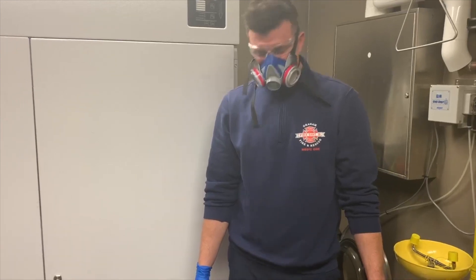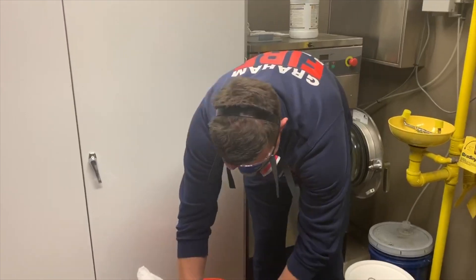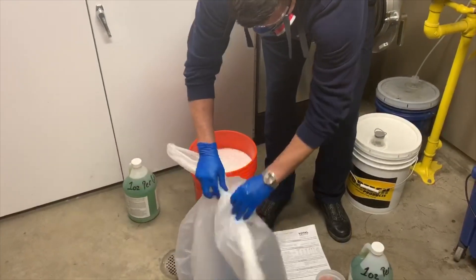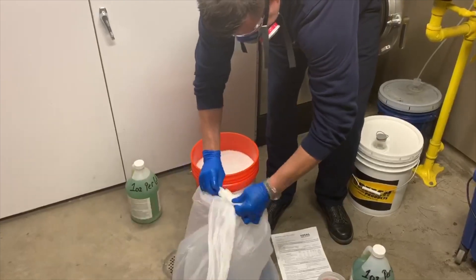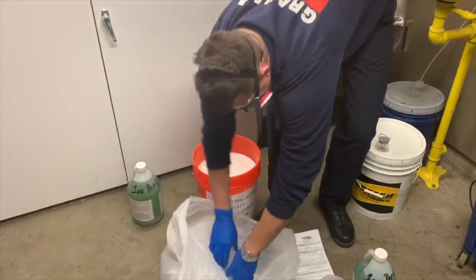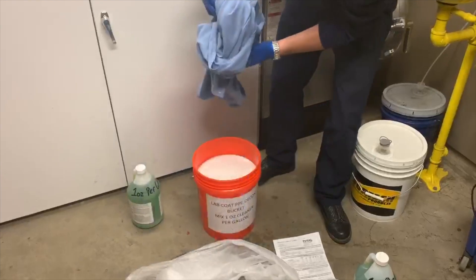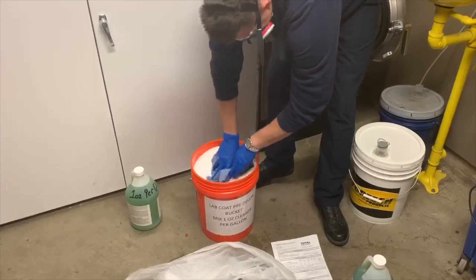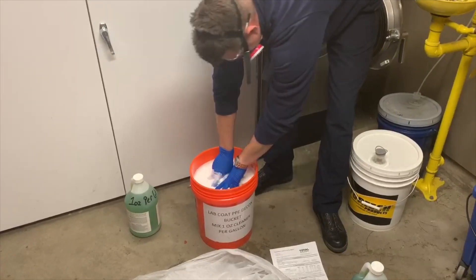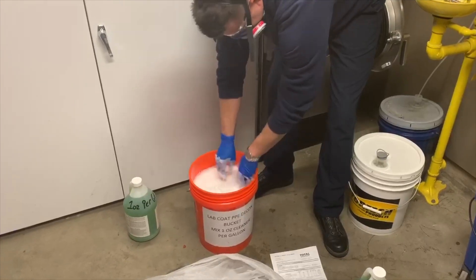Now that we've got the solution mixed up and Justin has his clean PPE on when he got back to the station, he's going to take the lab coat out of the bag and submerse it in the bucket of solution. We're going to leave this for 10 minutes and let it soak. The solution is rated to kill all viruses and bacteria, including the coronavirus. If we have more than one coat we can do multiple soaks, but this bucket should fit three or four coats. We're going to let it soak for 10 minutes.